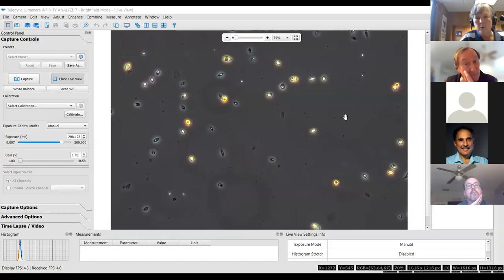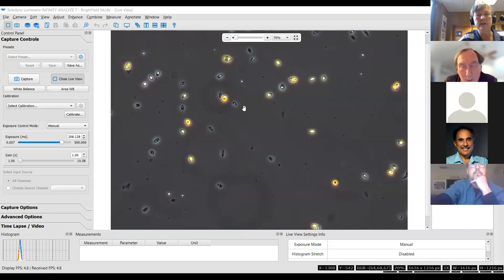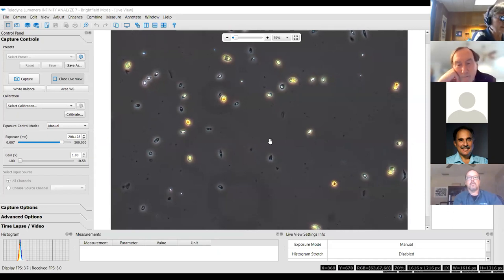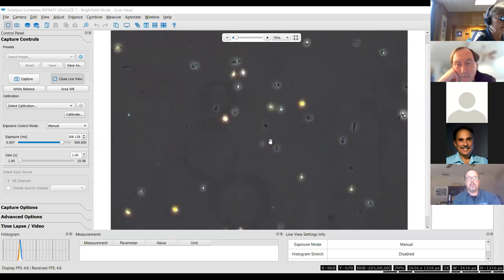So, all right. Let me take a look at some of these that he just talked about. We're going to go with a couple of greens first. I'm just going to do some examples of how we would go through this ID process. This is actually a live sample, and these are all small little greens. It turns out that there are some hints here as to what the majority of these cells actually are. When you pull up a sample and think, oh crap, what is that? Then you're going to start looking around.